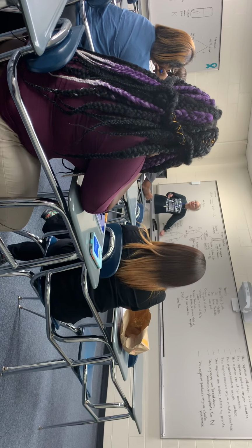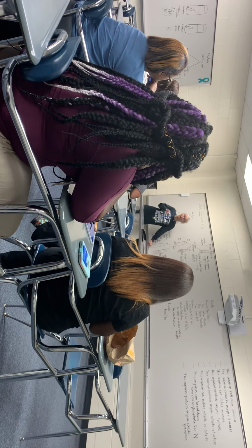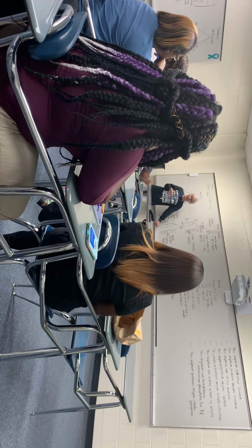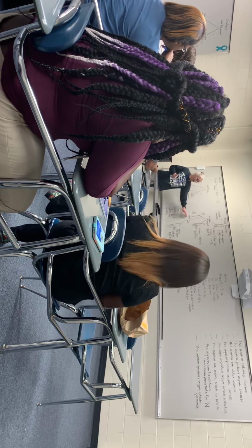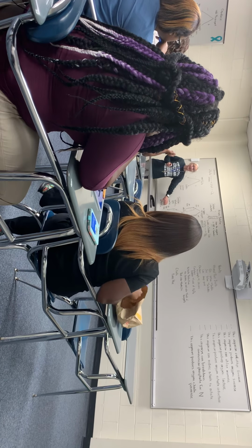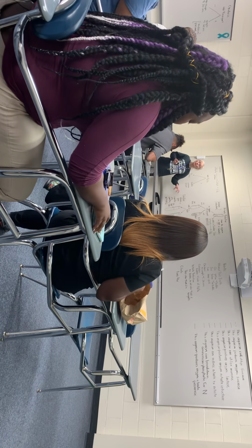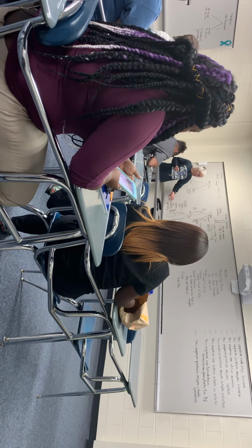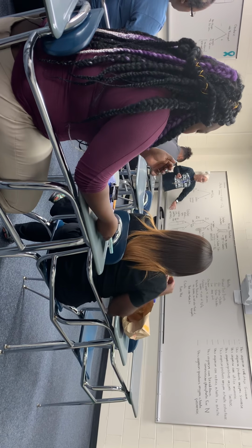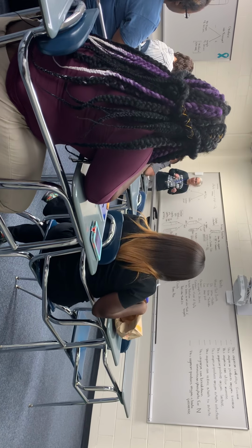So when you add the zinc dust, if it turns red, you would know it was a negative, that the nitrate was not used. Your organism does not produce the enzyme nitrate reductase. If you add the zinc dust and you don't get that red color, that tells you the nitrate's gone. So it was converted into something that you didn't test for. So this is the final positive that can occur. Okay? So you got lots of possible positives and each one tells you a different thing happened.